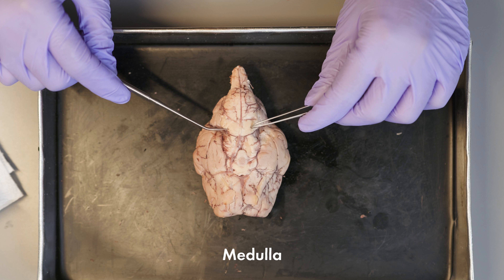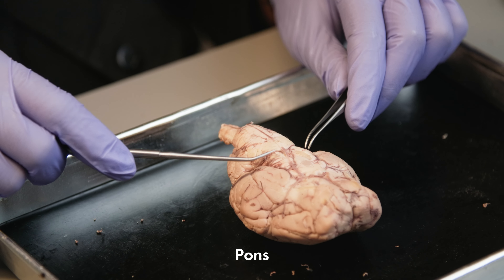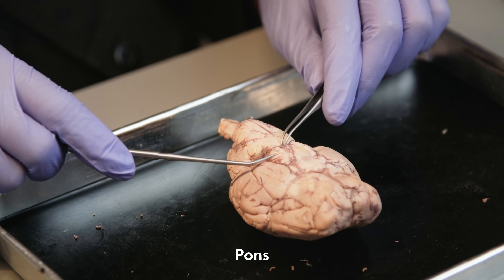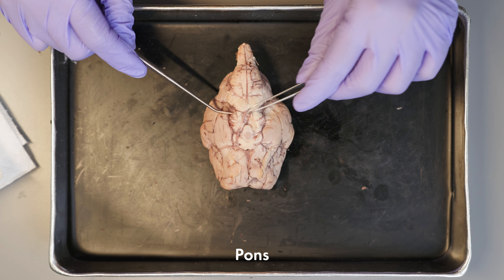The medulla also contains the reflex centers controlling coughing, sneezing, hiccuping, and more. Next you will find the pons, which contains nerve tracts that connect the cerebrum with the other parts of the brain and spinal cord. And here is the brain stem and the spinal cord.